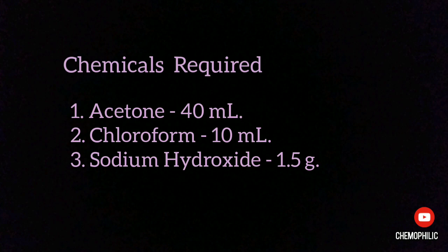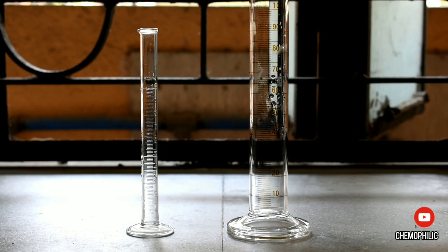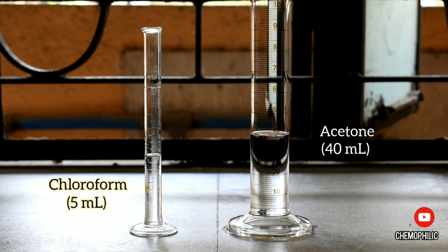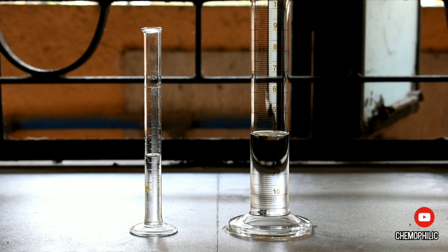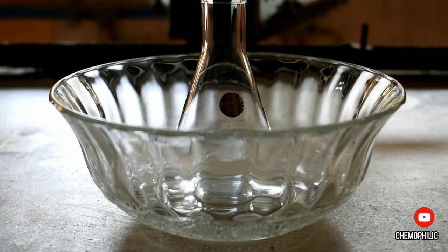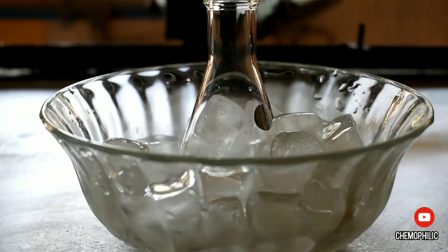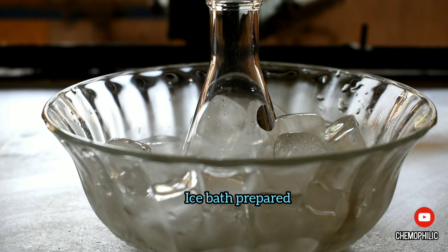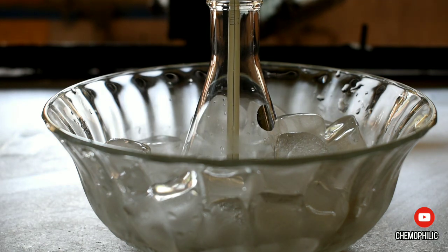I require three chemicals: acetone, chloroform, and crushed sodium hydroxide. I took two measuring cylinders—a 100 ml measuring cylinder to take the acetone and a 10 ml smaller measuring cylinder to take the chloroform. I took the chemicals and now it's time for the setup. A conical flask of 100 ml is kept in a trough. Now I prepared an ice bath and inserted a thermometer to record the temperature.